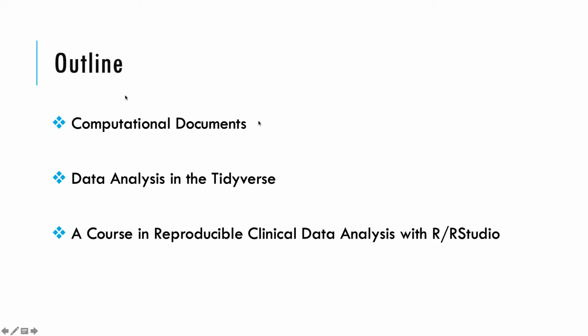I'll be introducing two concepts that you may be unfamiliar with, that of computational documents and that of the Tidyverse. And as I'll explain in greater detail, a computational document is a document that has executable code inside of it. And I'll explain why that has some major benefits, not only for reproducibility, but also implications in the entire workflow for data analysis and pathology.